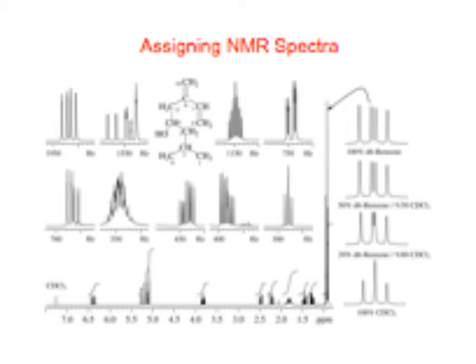But if we had one stereoisomer, would that have been a doublet? No, it'd have to be equivalent. Because if you have R chirality here, then you have two signals. If you have the S, you'd have two signals as well. Maybe you could say if you had 1 and 9, then it would be 9 and 1. They'd be switched, but it would give you the same spectrum.